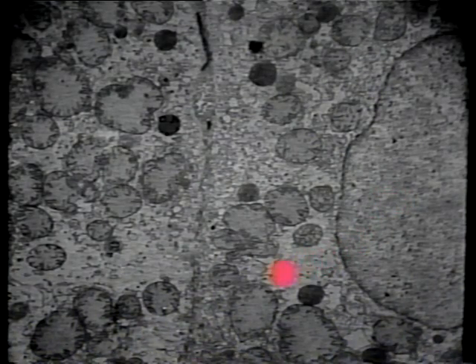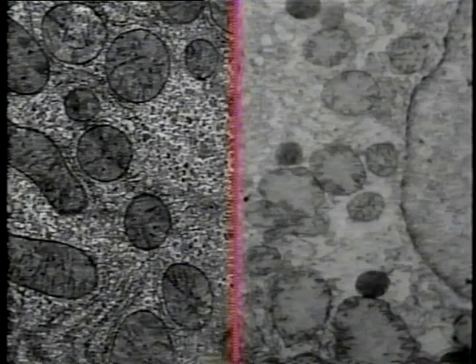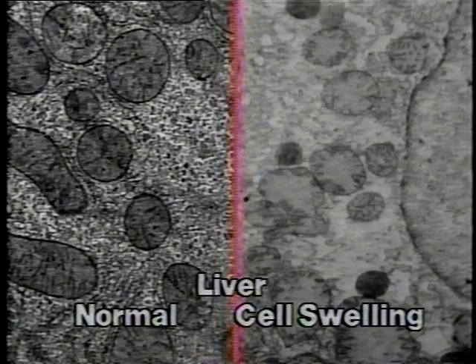Note that the cell matrix is pale, reflecting increased water content. Look at these mitochondria. They are enlarged as a result of the influx of water. They are pale and so distended that the cristae are widely separated and compressed toward the periphery. For comparison, note this more normal mitochondrion over here. To give you an opportunity to compare the electron micrographs of normal and injured rat hepatocytes, this frame shows a normal cell on the left and a cell poisoned with methylmercury on the right.